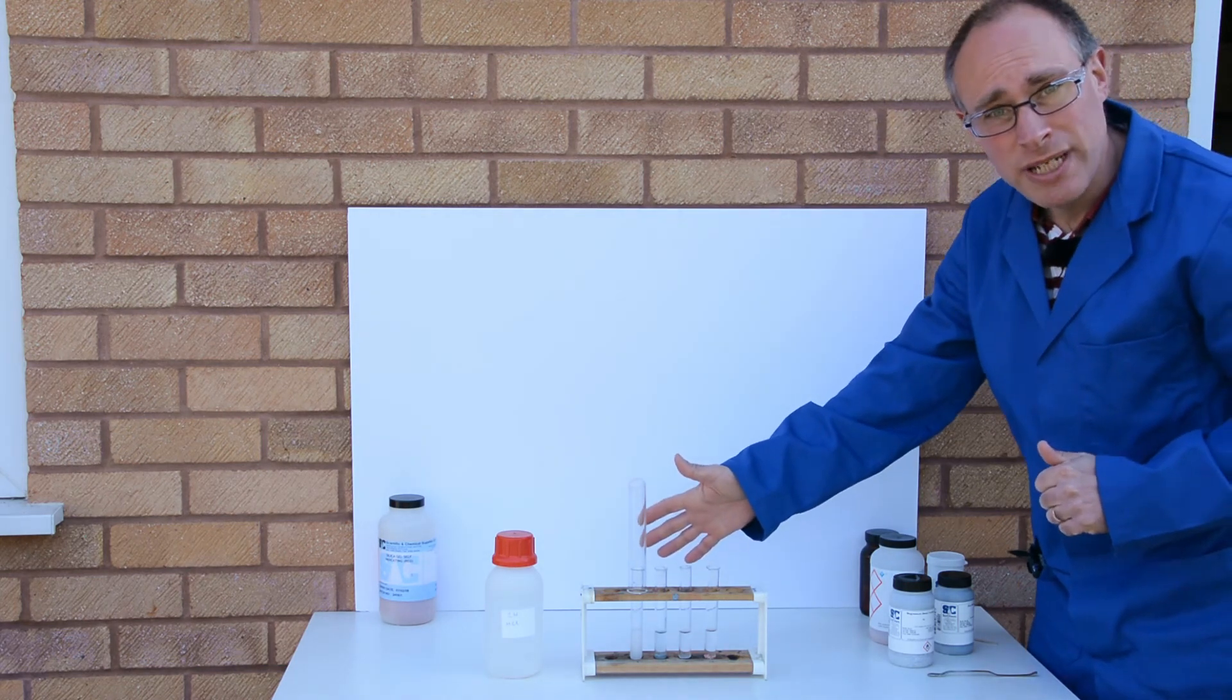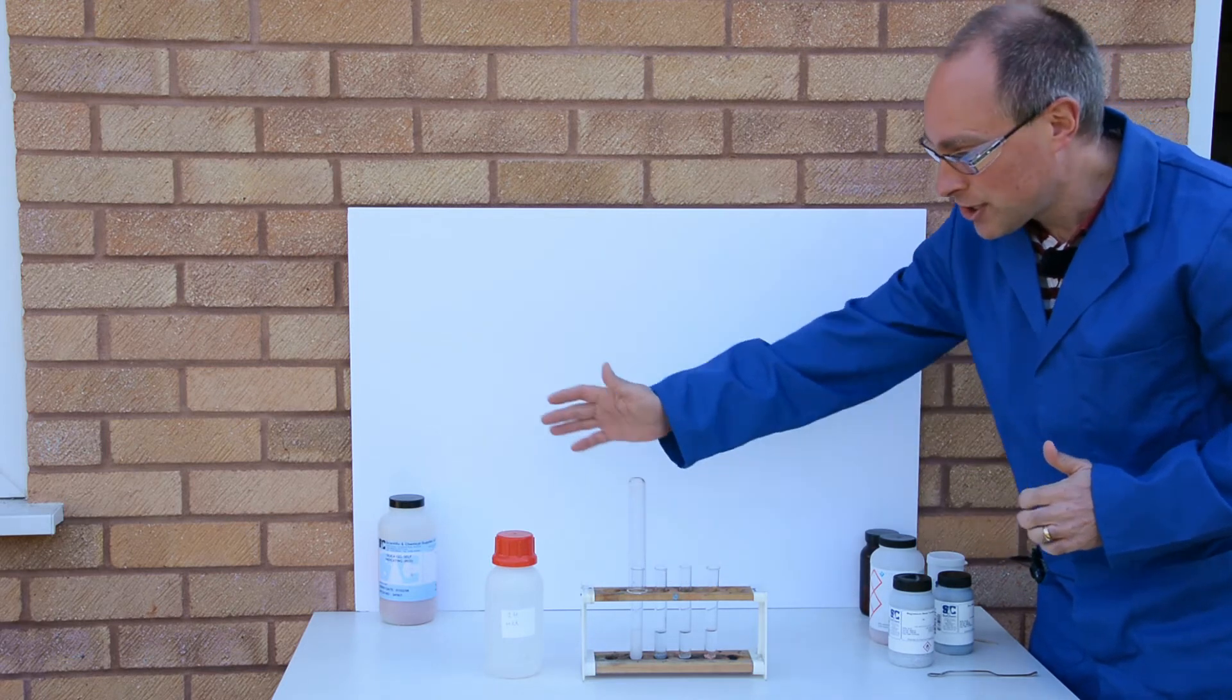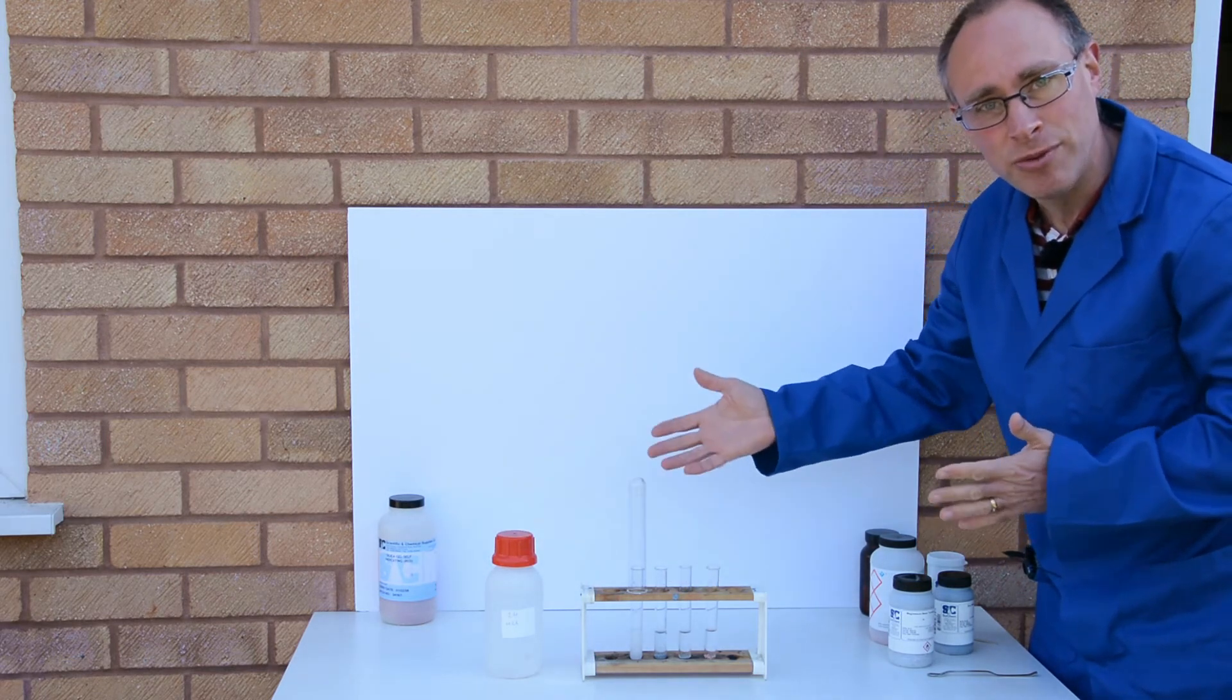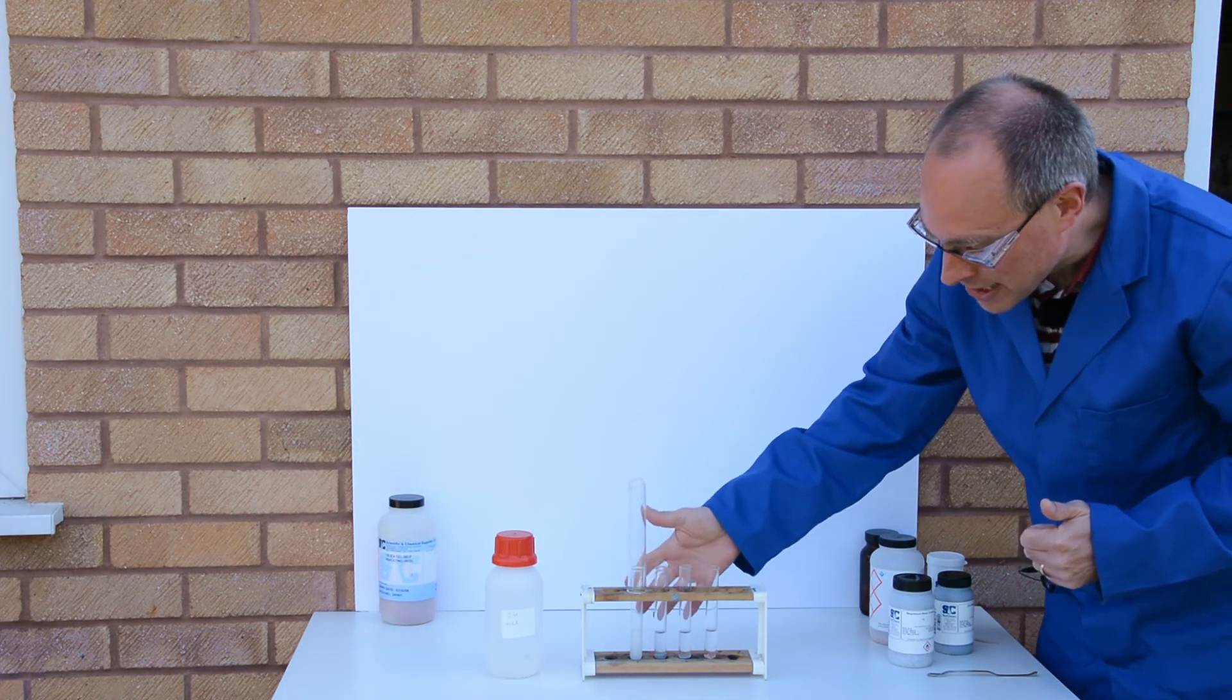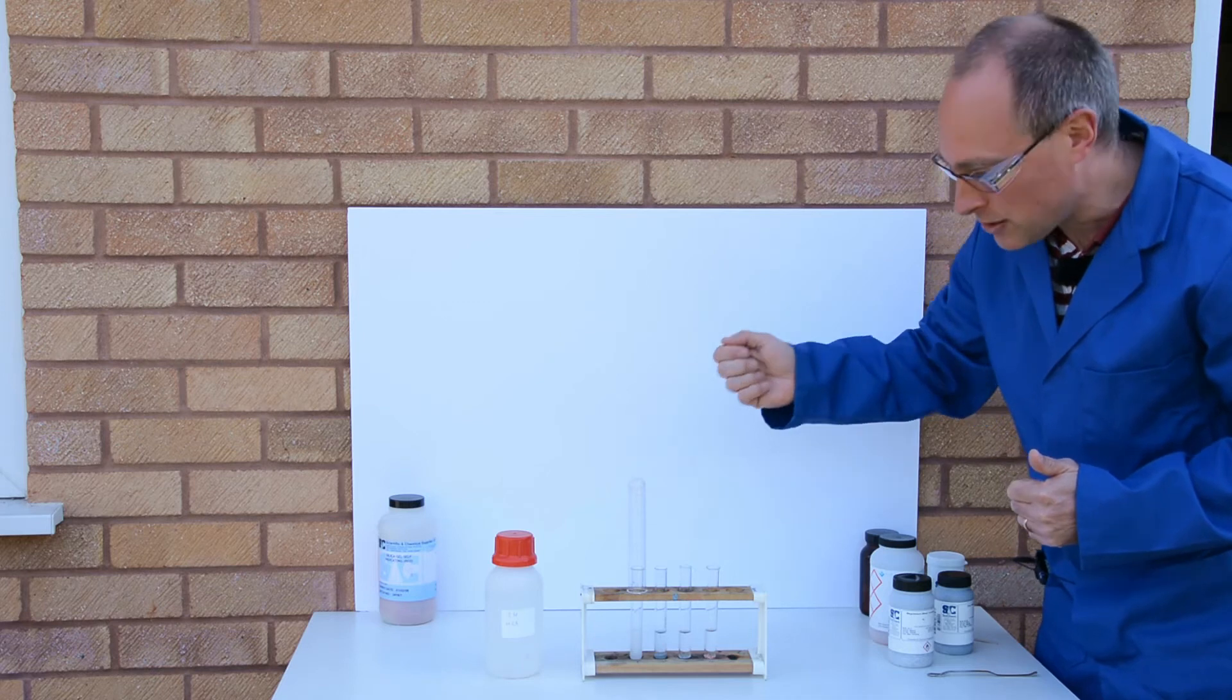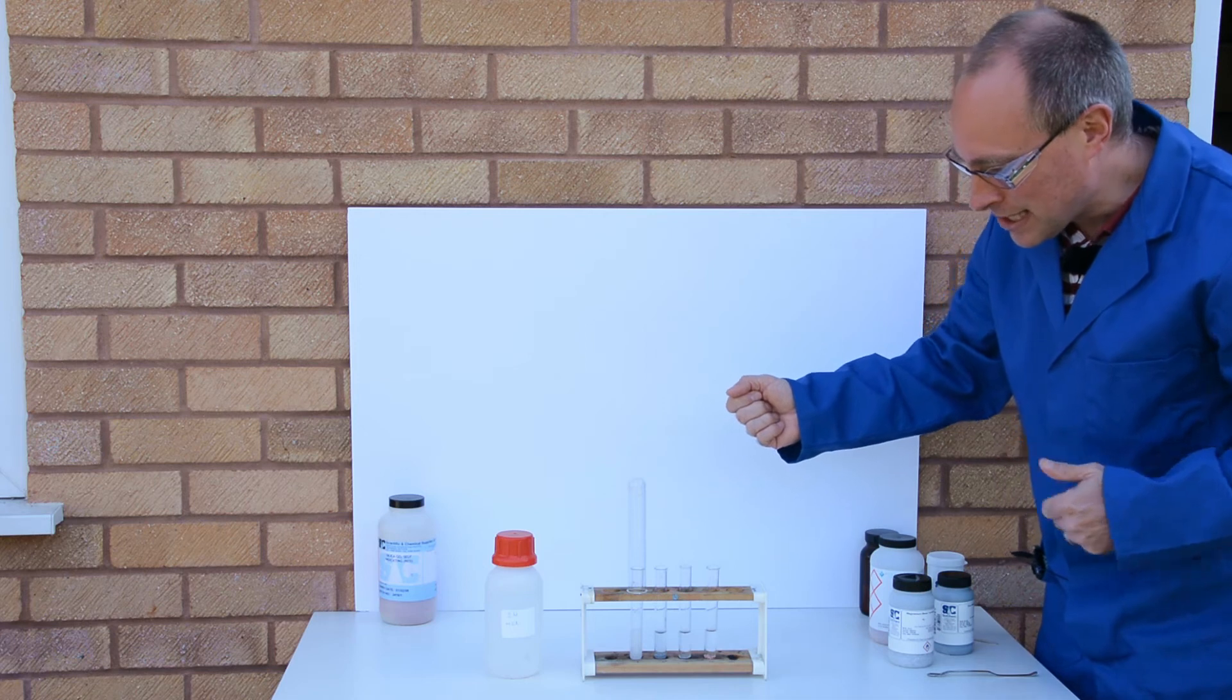So the chemical reaction between a metal and acid produces a salt - so if we're using hydrochloric acid we'll produce the chloride salt - and we can obviously see that a gas is being produced as well. So quite rapid effervescence with the magnesium.